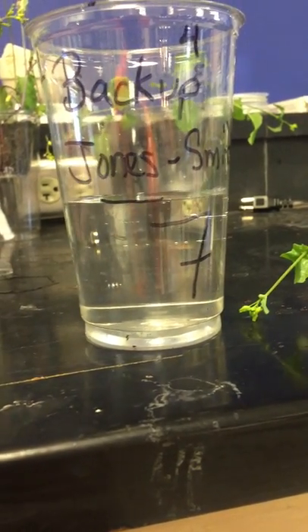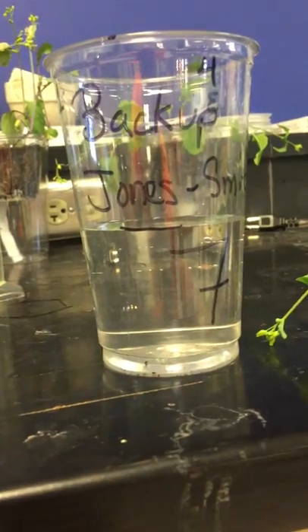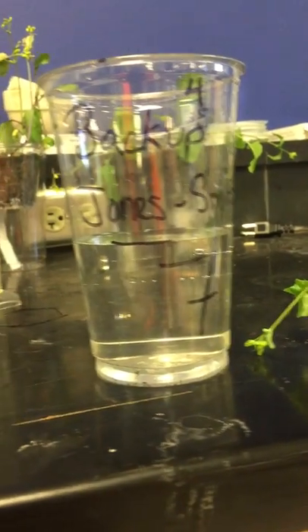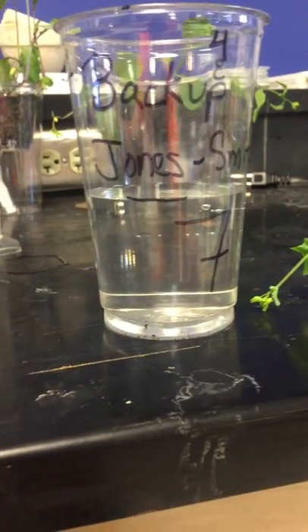Looks like right about there. So I have some leftover water — not much, looks like about a milliliter. So I'm going to go with 149 milliliters: 50 in the first one, 50 in the second one, 49 in the third one. And so that's what I'm going to report on my data — 149 milliliters.